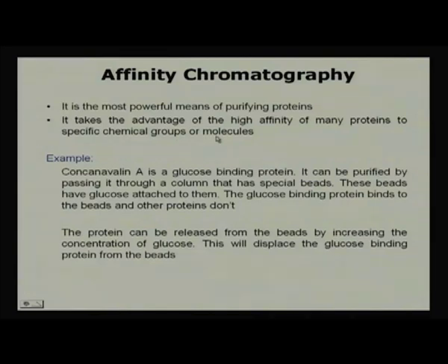For example, what I was just discussing about hydrophobicity is also a type of affinity chromatography. In my initial classes when I discussed macromolecules, I mentioned complex macromolecules like glycoproteins. These molecules can easily be separated with affinity chromatography.